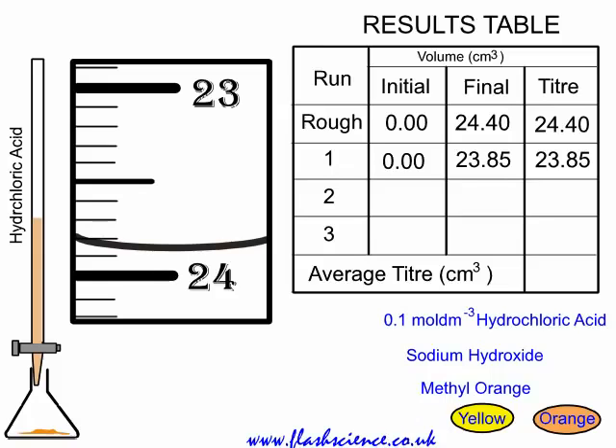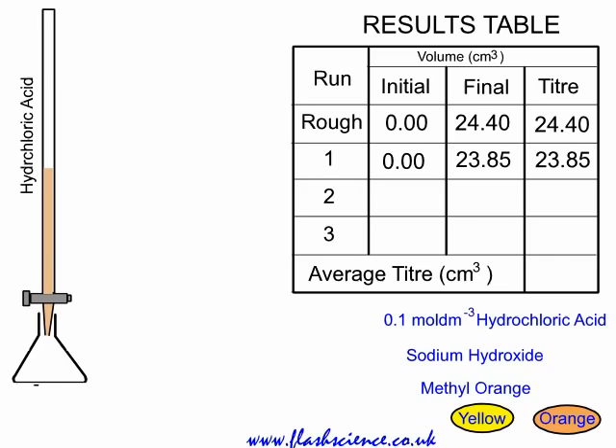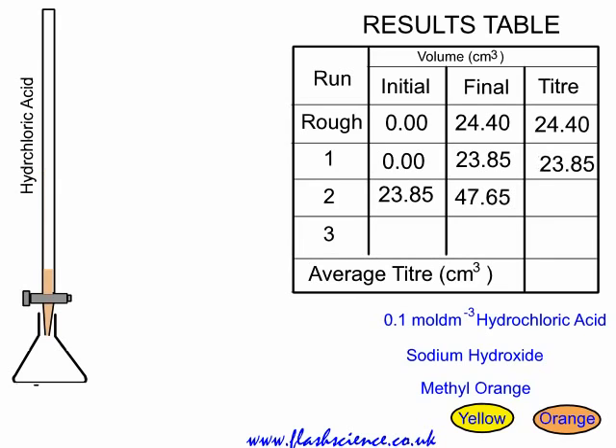Empty out the contents of the conical flask and rinse it well with deionized water. Because a burette can measure up to 50 cubic centimetres, you don't need to top it up again — we have enough for the second accurate run. The initial reading is 23.85, and again you obtain an accurate titer. The final reading is 47.65; taking the difference gives us our second accurate figure of 23.80.